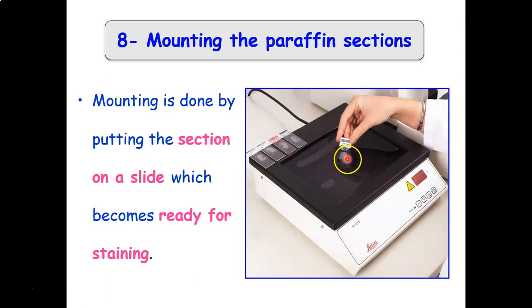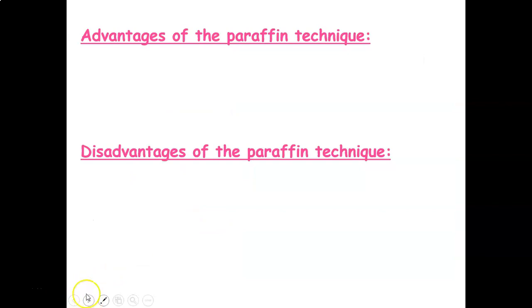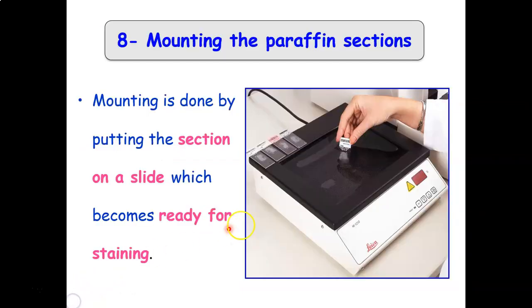I mount the section on the slide, and this slide now I will put into a warm hood to evaporate the water, and at this moment the thin sections on the slide are ready for what?